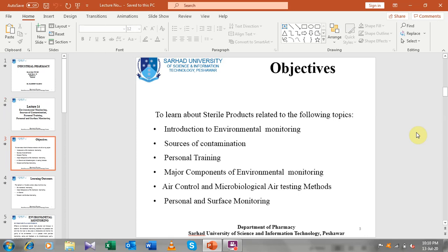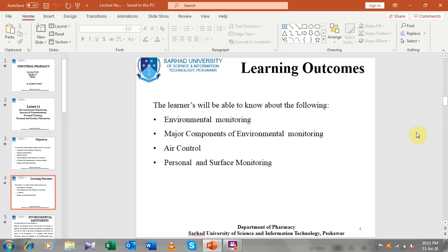Dear students, the main objectives of this lecture are to learn about sterile products related to the following topics: introduction to environmental monitoring, and sources of contamination, the different sources of which I have already told you about, and how the professionals and workers are trained in their particular areas, and how sterile products are prepared in the pharmaceutical industries. Then the major components of environmental monitoring, air control, and microbiological air testing methods: how air is controlled and how microbiological air is tested, how air samples are taken in pharmaceutical industries, and what the different methods are for microbiological air testing. And finally, in this lecture, we will discuss personnel monitoring as well as surface monitoring.